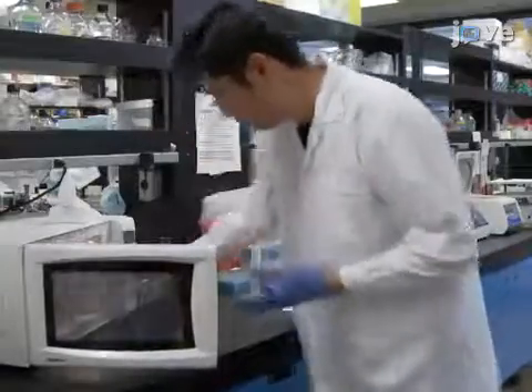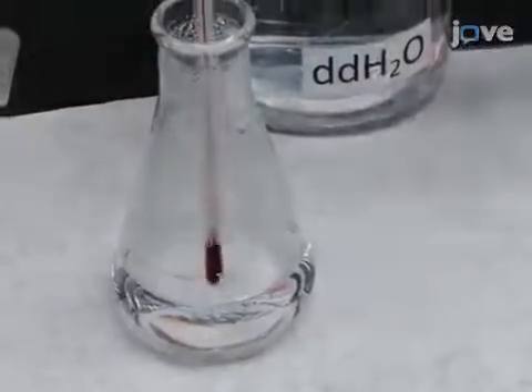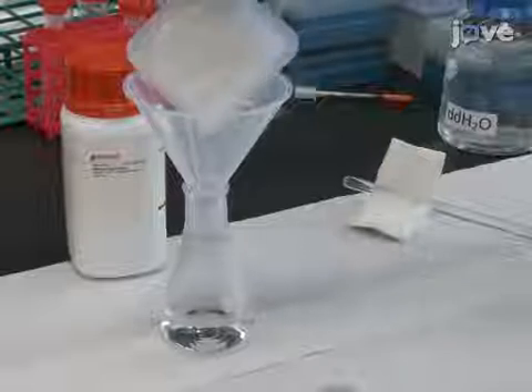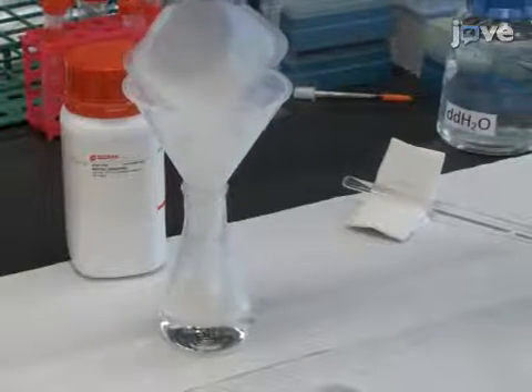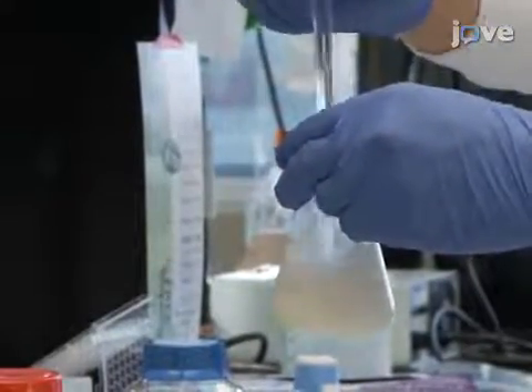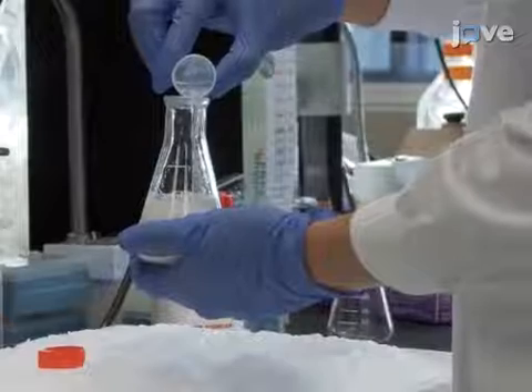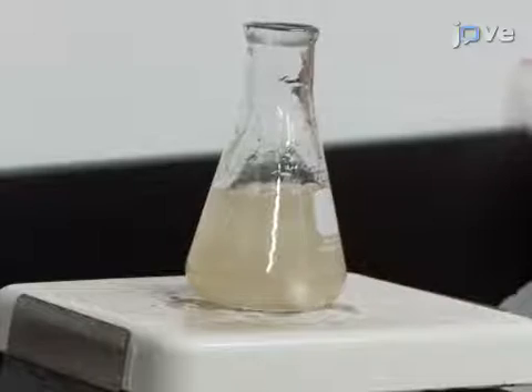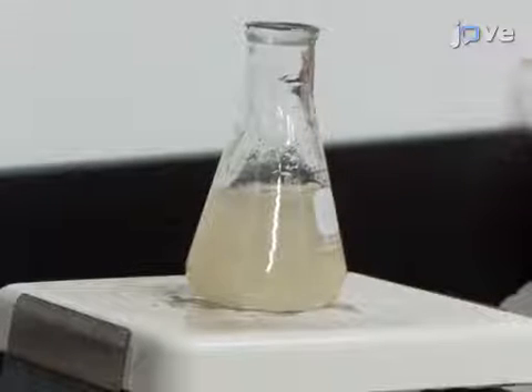Before preparing the aggregates, heat 50 milliliters of ultra-pure water to 80 degrees Celsius and add 10 grams of methylcellulose powder. Agitate the suspension until the particles are evenly dispersed. Then add cold ultra-pure water to a final volume of 100 milliliters and stir the particles overnight at 4 degrees Celsius until the solution becomes clear and straw-colored with no visible solids.